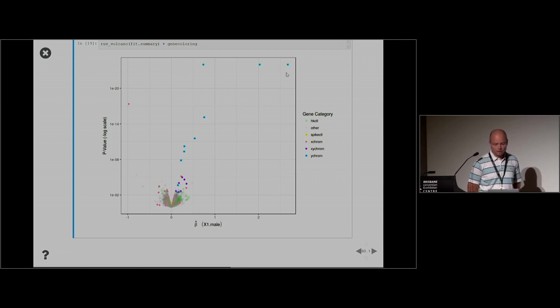I don't know. In some sense, this is a biological question, because what we're looking at is the differences in gene expression in the brains of men and women. And so I suppose the biological conclusion is that there's a couple of genes that are very different between the brains of men and women, some that are a little bit different but clearly statistically significant, and the vast majority are not different. So you're saying that this is not because of adjustment? No. But it's good to be skeptical.